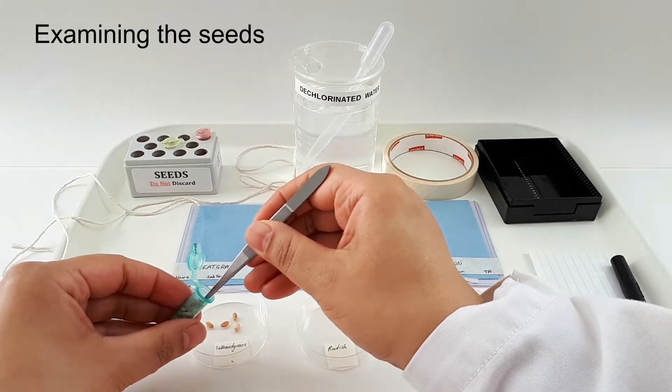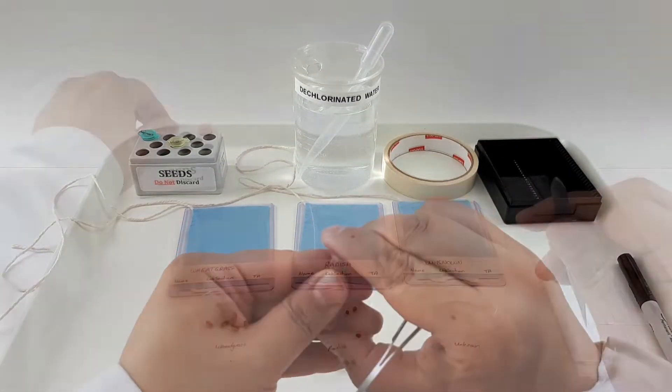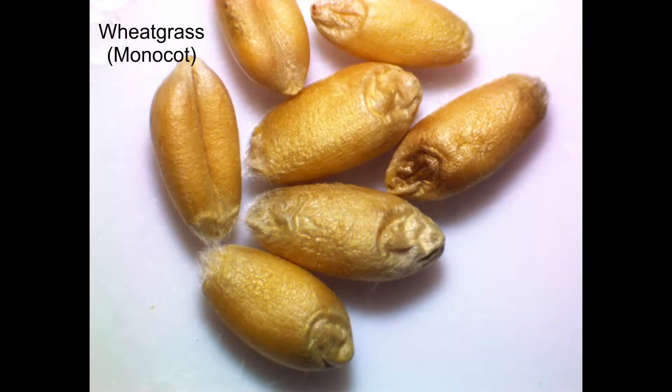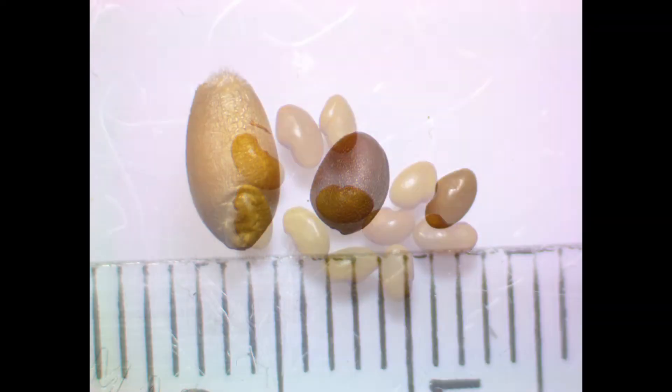Place five to six of each type of seed into the small dishes provided and take some time to examine them using the dissecting microscope. Try to distinguish between the external features of the monocot, the eudicot, and the unknown seeds.